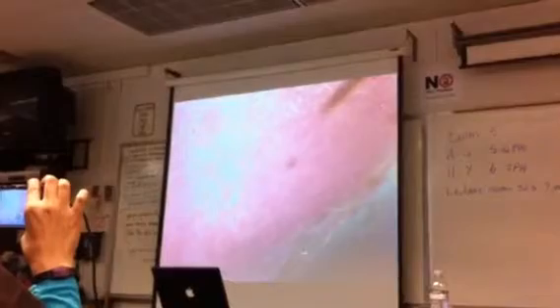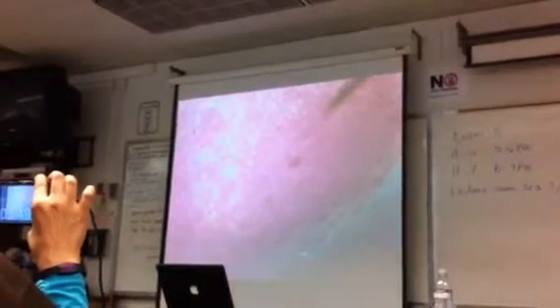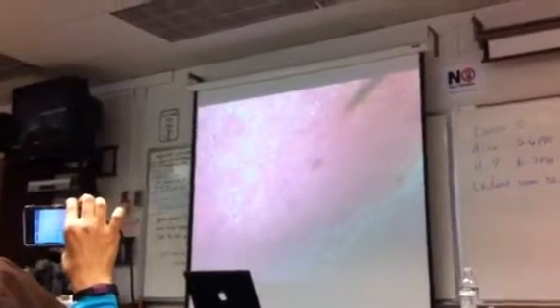Now, more right along the border there. You guys are just going to have to look at these on your microscope, right? Because this is just too weird. I don't know why this is doing this.